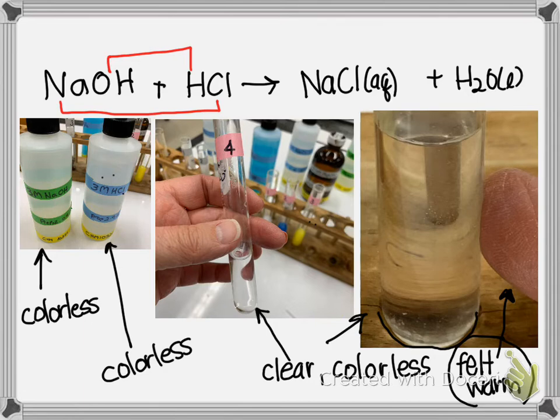Now that's the end of the observations, but I would like to balance one equation just so you remember. There are no post-lab questions in this lab. What you're doing is recording your observations in the boxes, and then you're going to balance all the equations. And the balancing of the equations is what counts as your post-lab questions.